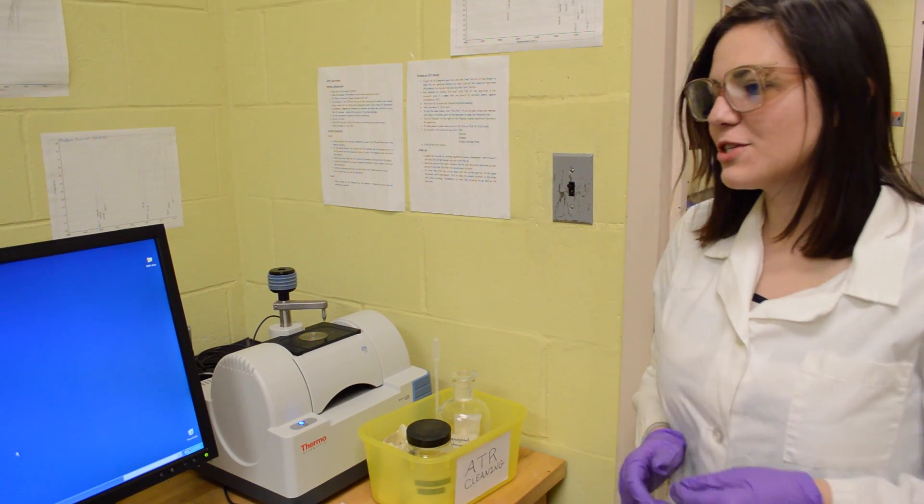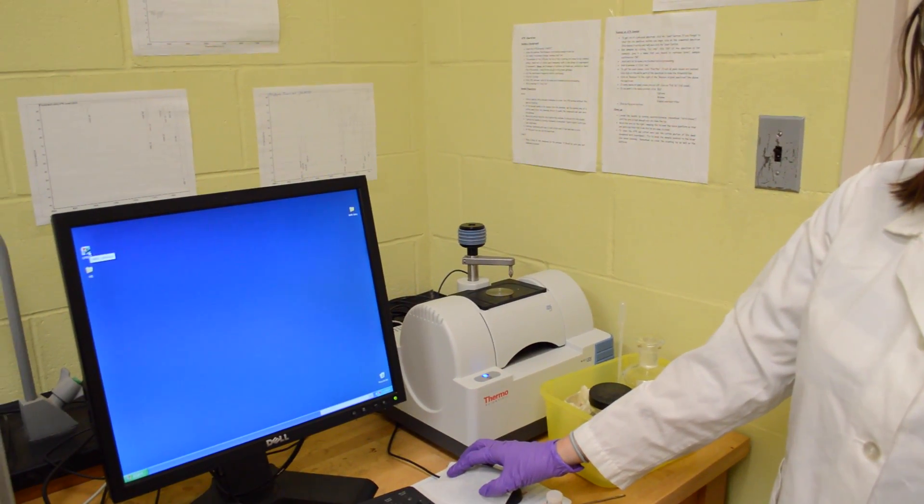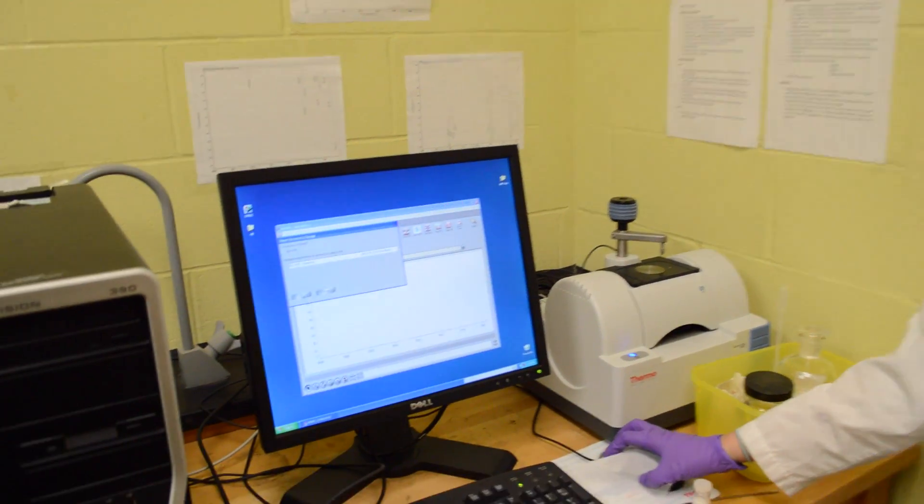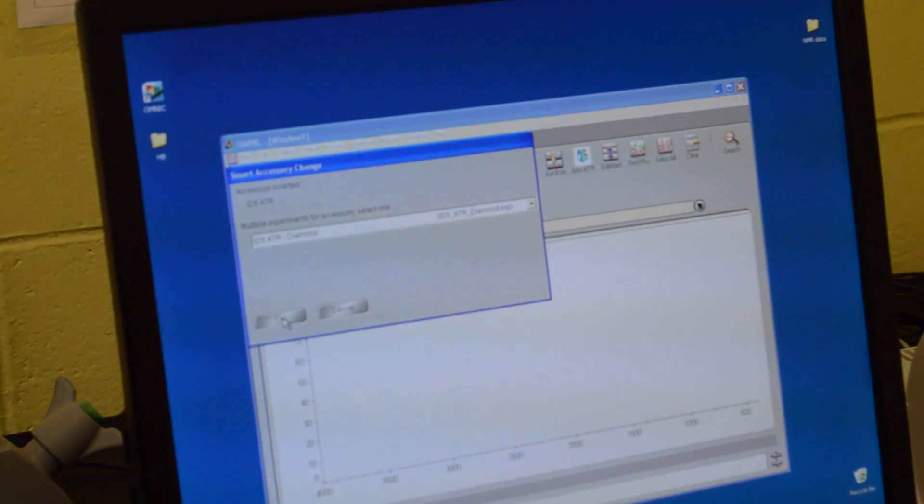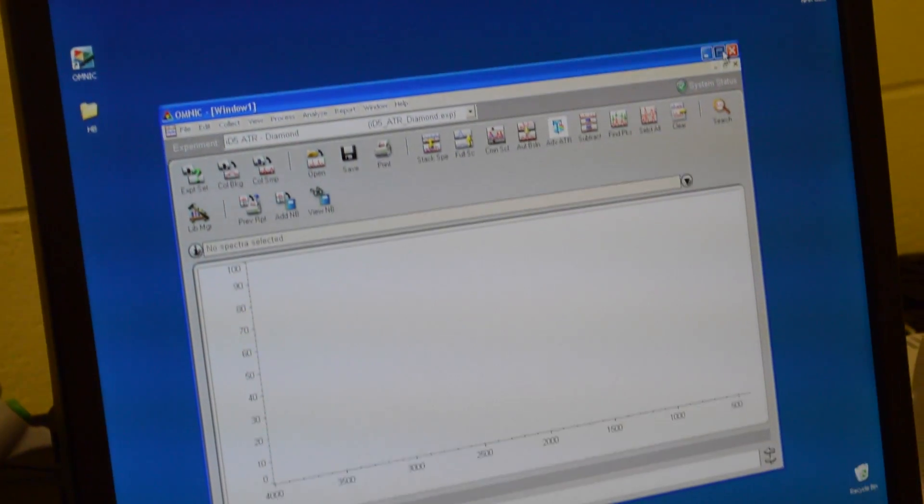The first thing you're going to want to do is turn on the OMNIC program. Just double click it on the computer right here. This will come up saying you're using ATR, so you press OK, and maximize the window.